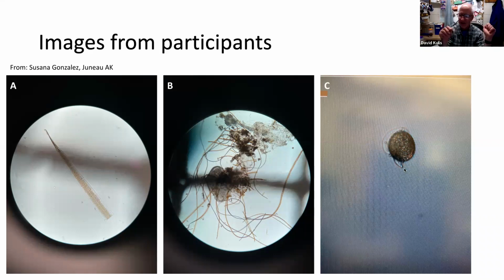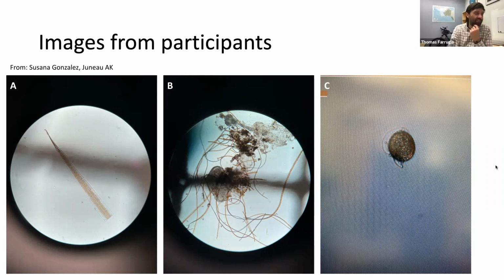Kate mentioned this also: if cells are in the wrong orientation, you're just not going to see the typical shape. So I think it's important to quickly assess your whole sample and then try to count it, and hopefully that'll give you a clearer idea of what you're seeing in your sample. Yeah, I think that's a great point.